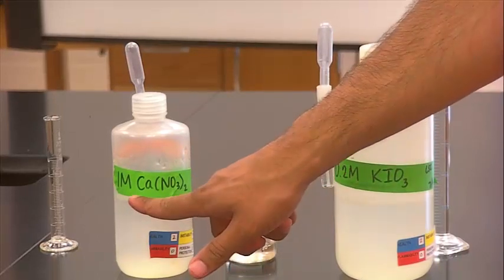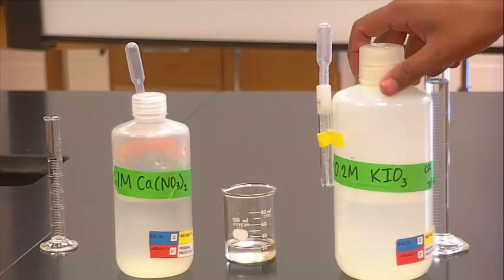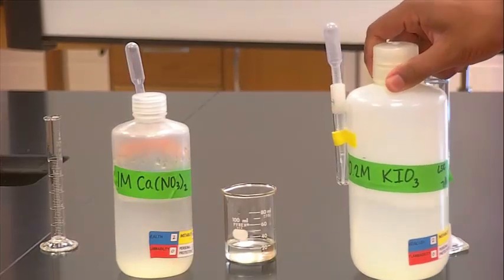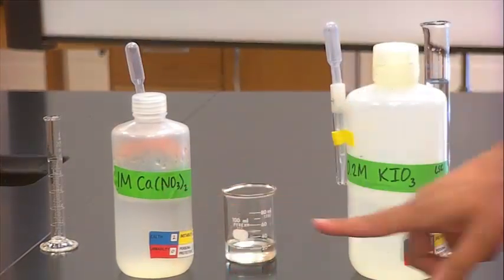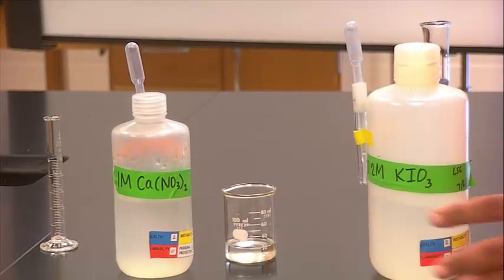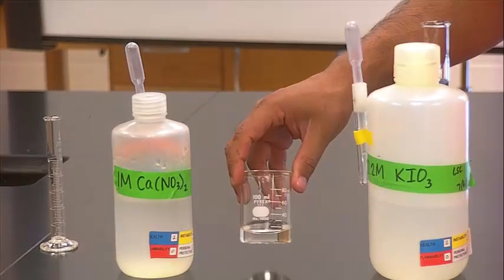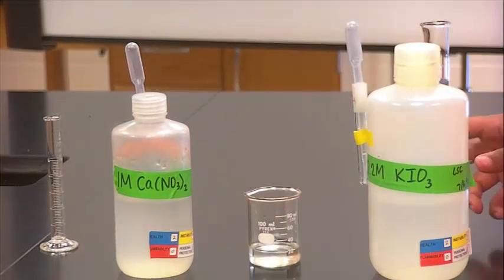The calcium ion here will react with the iodate ion. Remember, potassium iodate is also completely soluble. The calcium ion will react with the iodate ion to give you calcium iodate. However, as you know, this is sparingly soluble, and it is in an equilibrium with the calcium ion and the iodate ion. I have already put in the 20 mL of calcium nitrate.